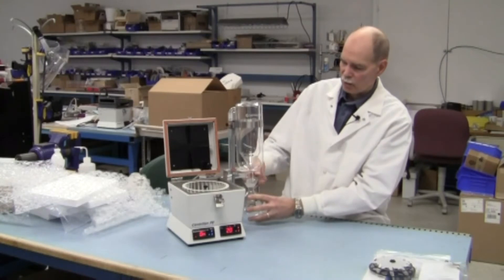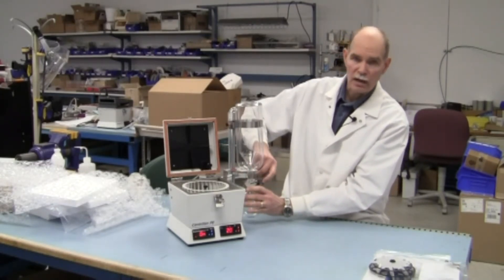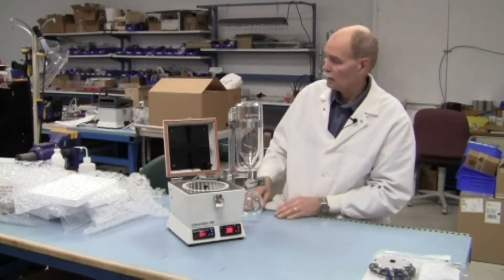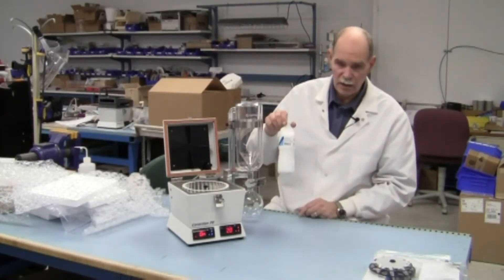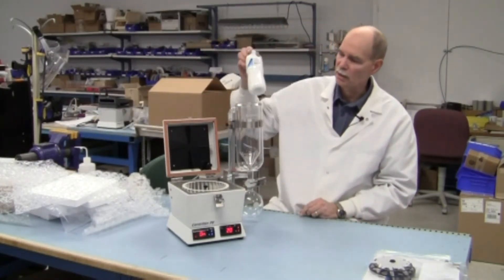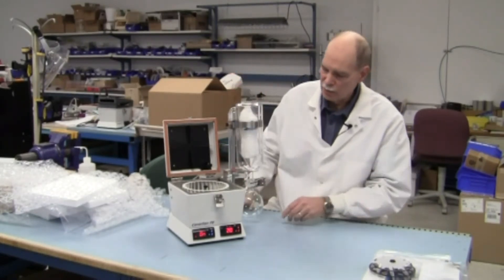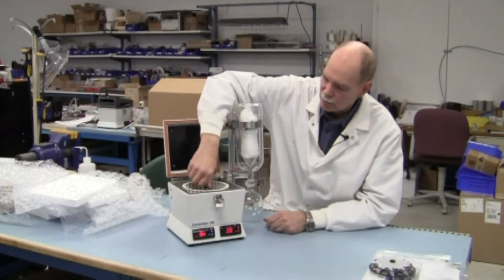For the cold trap, many times we use a frozen water bottle at the factory — it's very convenient and keeps the trap clean. I forgot to freeze the water bottle, but we've had a storm recently so I filled a water bottle with snow. We'll use that to generate the cold in the trap and hopefully cause some condensation during the presentation.